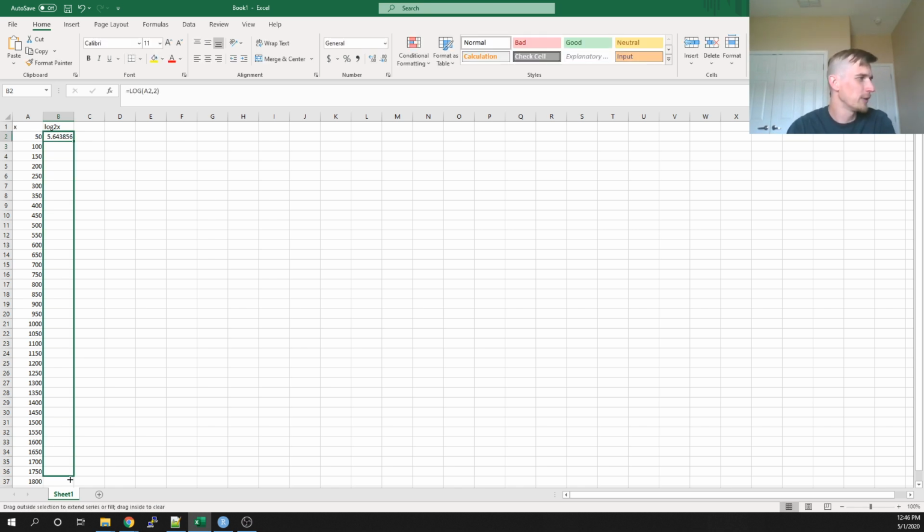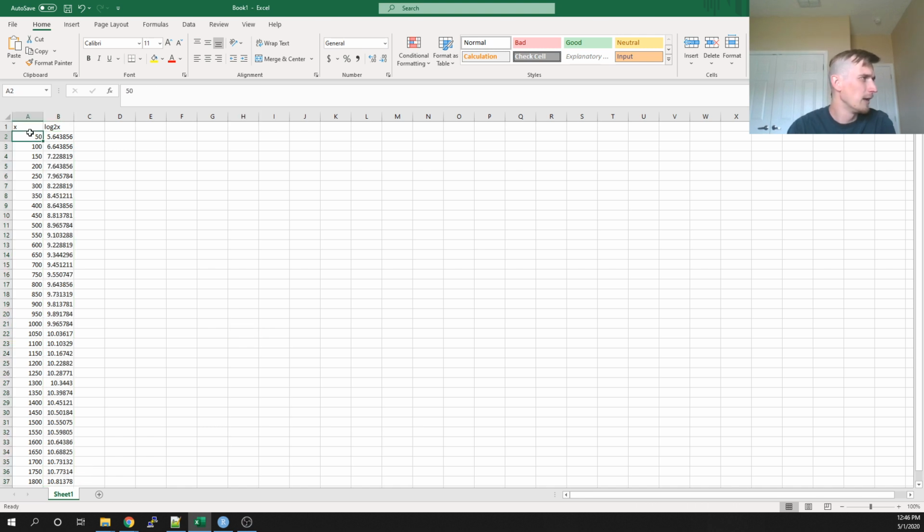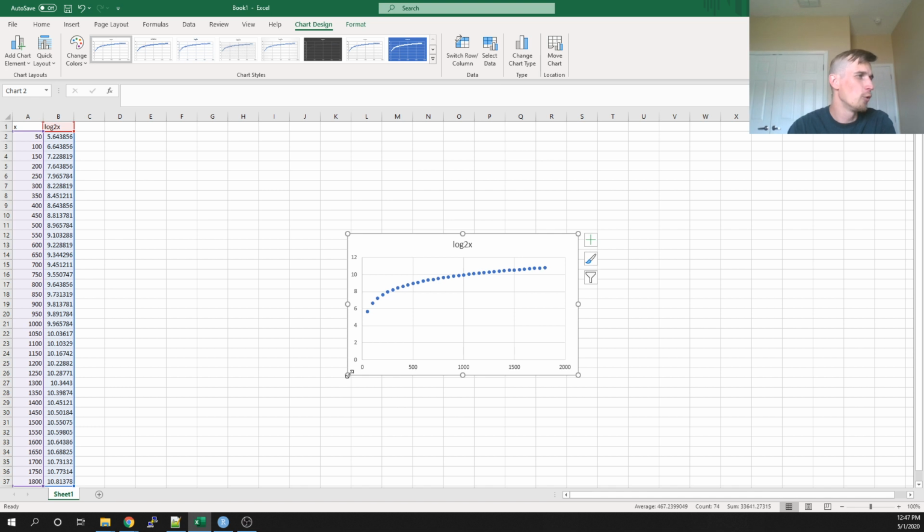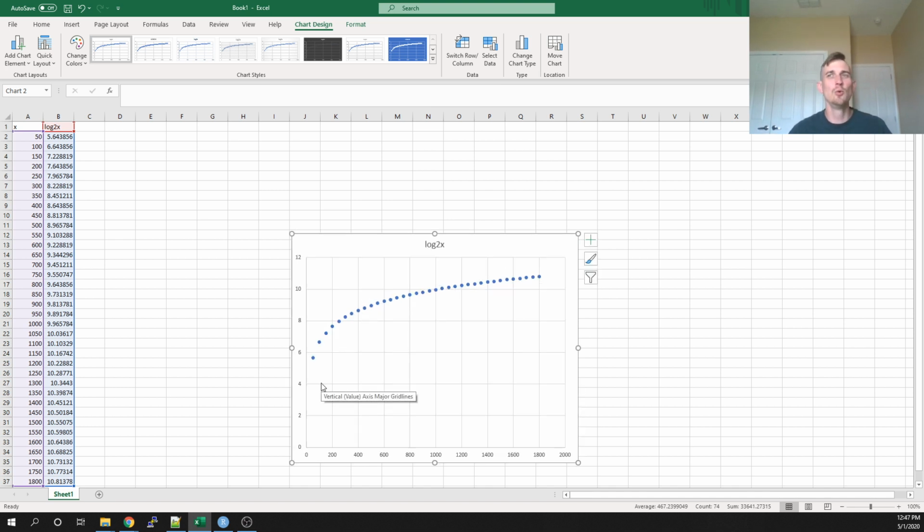I'm just going to log2 transform all of these values, and we'll plot these out in a nice dot plot. Okay, and so more or less what it's doing is smoothing these expression values out.